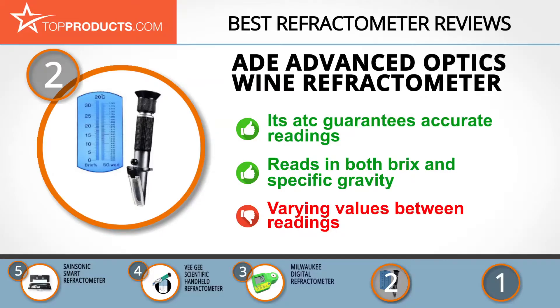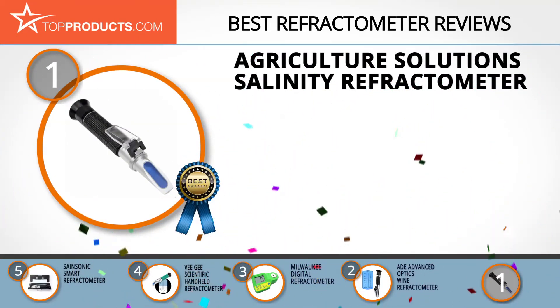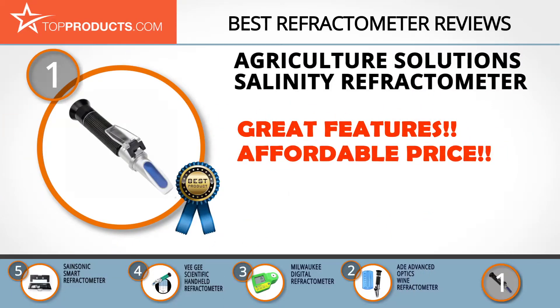It has a dual scale for measurements in Brix and specific gravity. One little issue, however, is that values may vary slightly between readings of the same sample. Finally, the Agriculture Solutions Salinity Refractometer made it to our top choice position because it provides a good array of features at an affordable price.